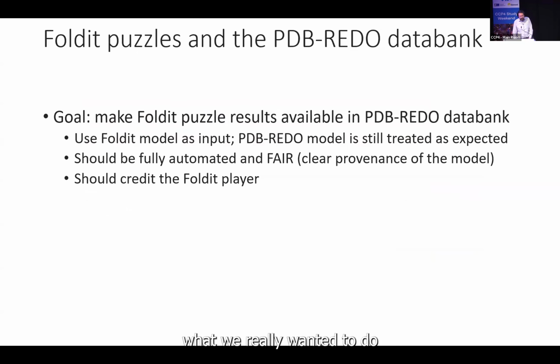So following up, what we really wanted to do is get these Foldit puzzle results and make them available through the PDB-REDO databank, but not as a final model, but rather as an input model, so that it still goes through the PDB-REDO procedure and users get what they expect from PDB-REDO, only hopefully better. And because Scott and I wanted to have it maintenance-free, we made sure that everything would be fully automated. And of course, because it's a data bank, everything has to be FAIR, and we have a clear provenance of where the model comes from. And of course, this is a model made by somebody else than the depositor, so that person, the Foldit player, should also get some sort of credit.